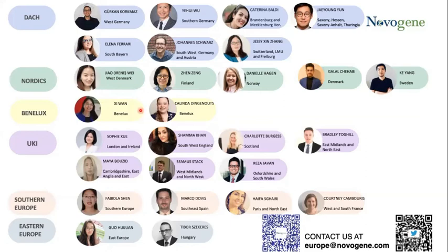Marissa Sinenovic has asked, in terms of personalized medicine, could you share what are possible advantages of Illumina short-read sequencing in detecting gene mutations that cause disease or rare mutations? In case of personalized medicine, okay.